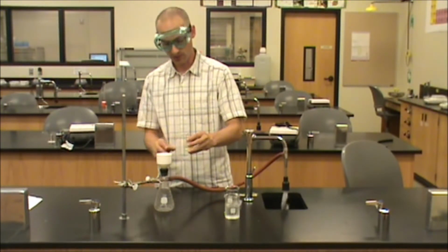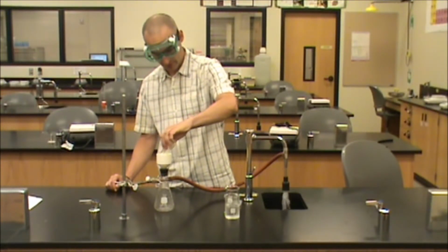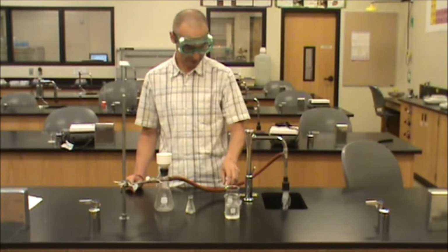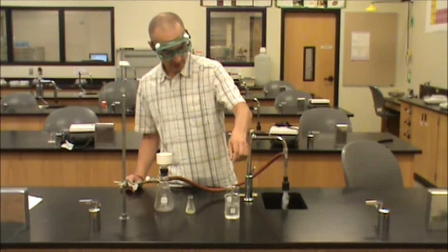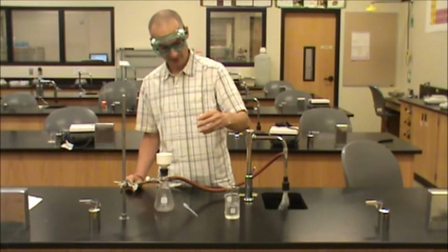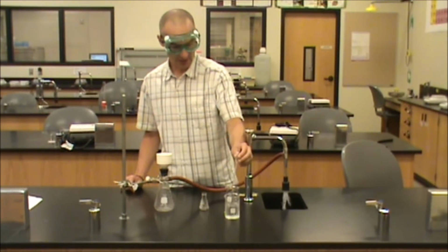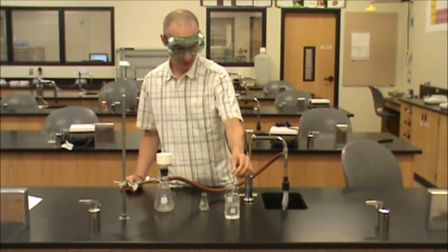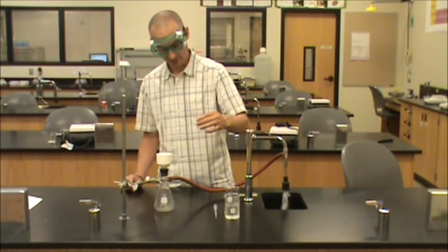I am now going to pour our crystals into our funnel. And our solvent should begin to fall through, and our crystals should remain on the filter paper. I'm going to transfer about 2 milliliters of ice cold solvent to our small Erlenmeyer flask to help rinse out the crystals. And I'm now going to repeat. So a total of approximately 4 milliliters of ice cold ethanol will be used to rinse off our flask.